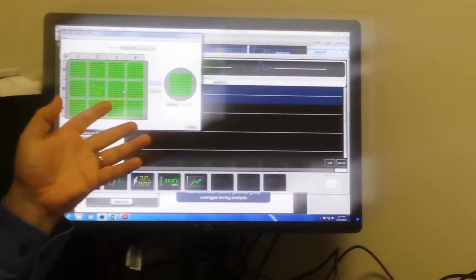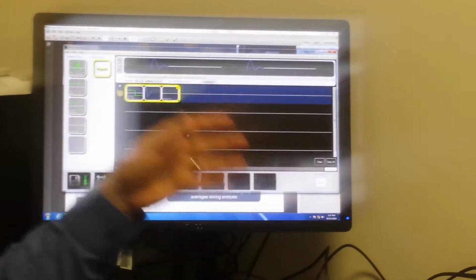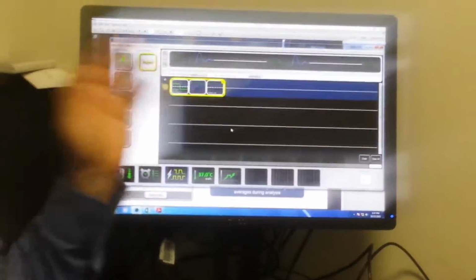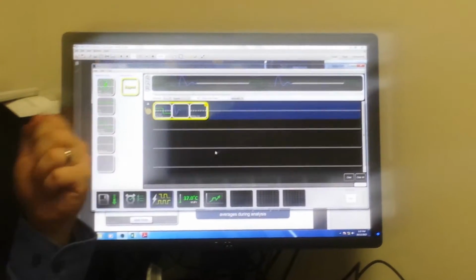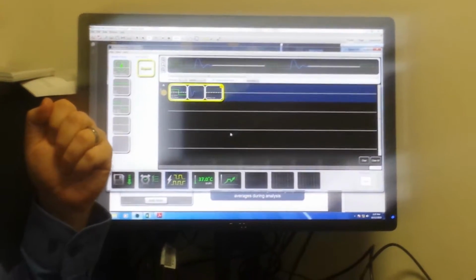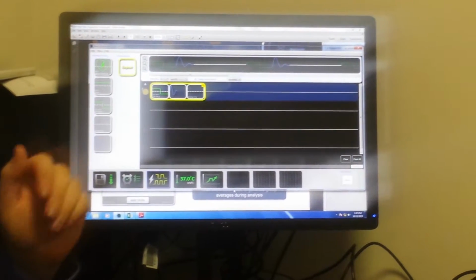You can check that: you put the plate on, hit play, watch it, and then you can just set up the stimulation while it's playing. So then you could reduce the file size if you select a certain... No, it'll be the same size.